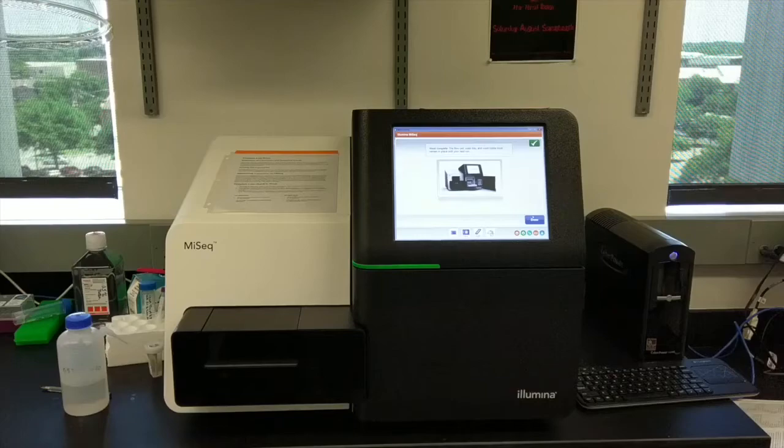This will take a couple of weeks just because it costs a high amount of money and we don't have enough samples to fill a whole lane. If we did, we'd be wasting maybe a couple grand. So at this point, we're waiting for any other lab members who will then start sequencing, and we'll do it all together, saving time and money.